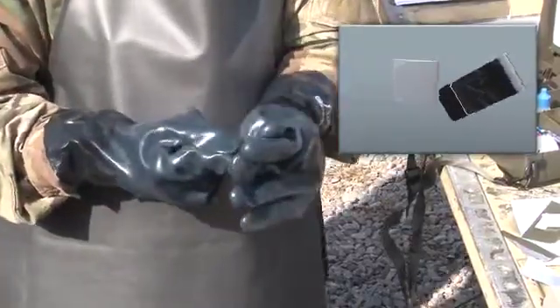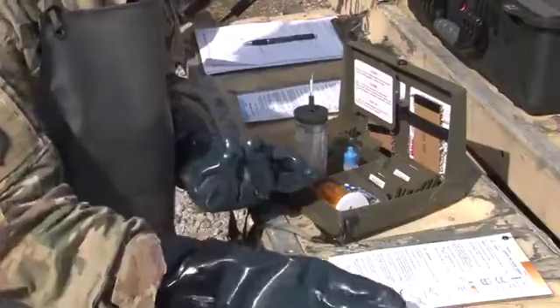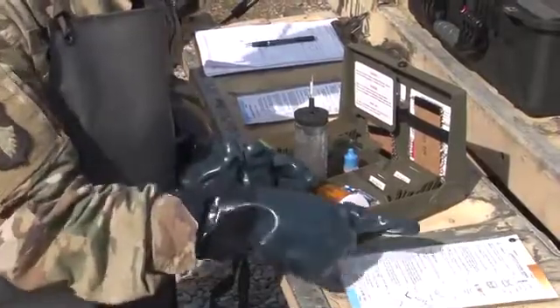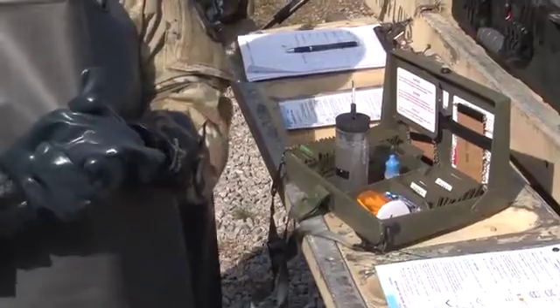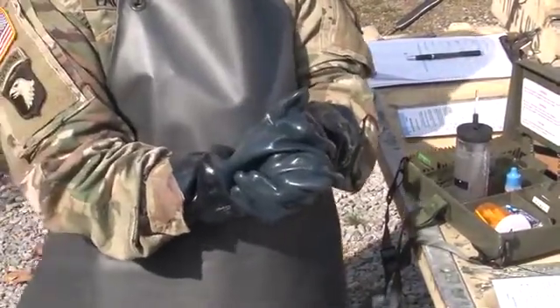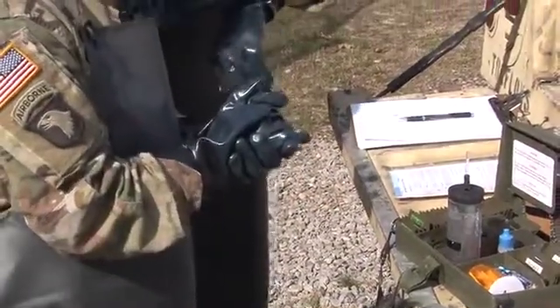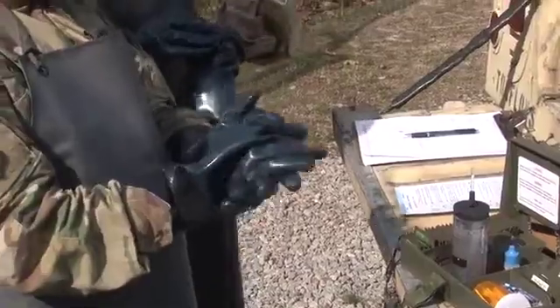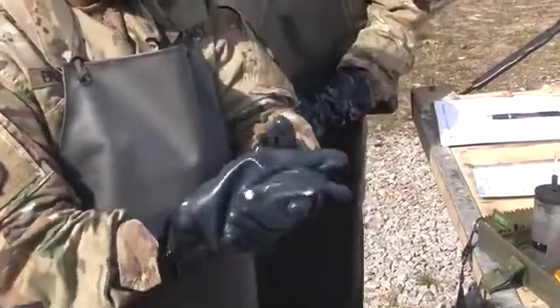Now think back to what you found the temperature of your water to be. Was it colder than 50 degrees Fahrenheit or 10 degrees Celsius? If you answered yes, hold the clip with the ticket between your palms. Keep gloved hands clasped together and heat the ticket for 3 minutes by firmly rubbing the heels of your hands together every 10 to 15 seconds.